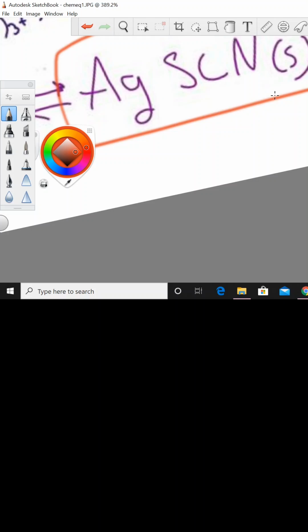We are going to talk about part D. So part D started off as this nice red, sort of pinkish color, which is the Co(H2O)6 2+ ion, a pinkish color. And then our cobalt chloride 2- is a blue color. So we started off with this red color.